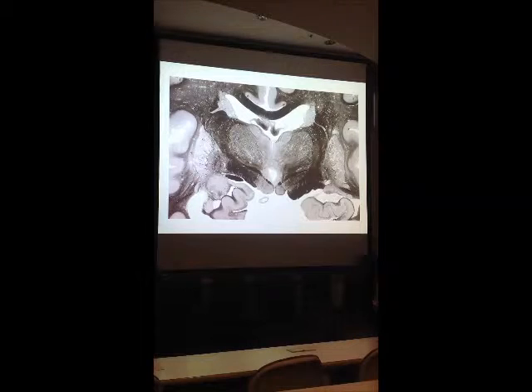Okay. So this is slide 32. This is a coronal section through the cerebrum, right? On a slide like this, you should see that there's a left side and a right side. You should remember the white matter staying dark, the gray matter staying light. So we see some cortical tissue out here on some of the surfaces, and you can see that there's a white matter core beneath the cortex. Certainly, I think you can see the corpus callosum connecting the two hemispheres.